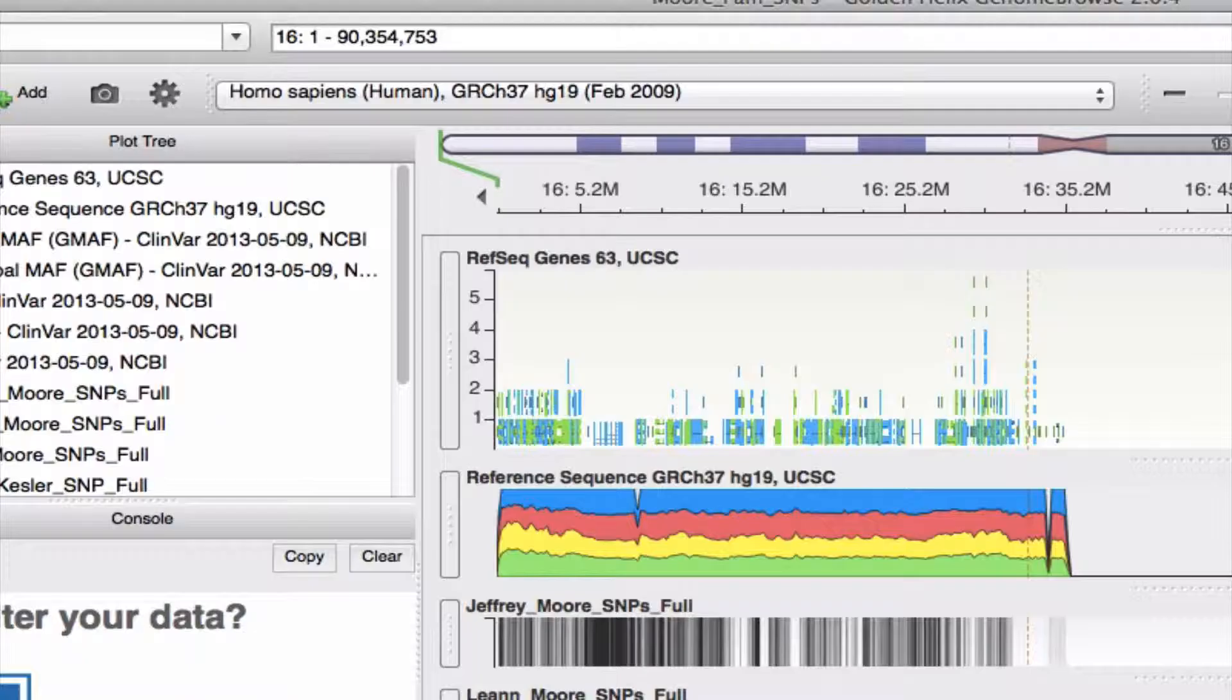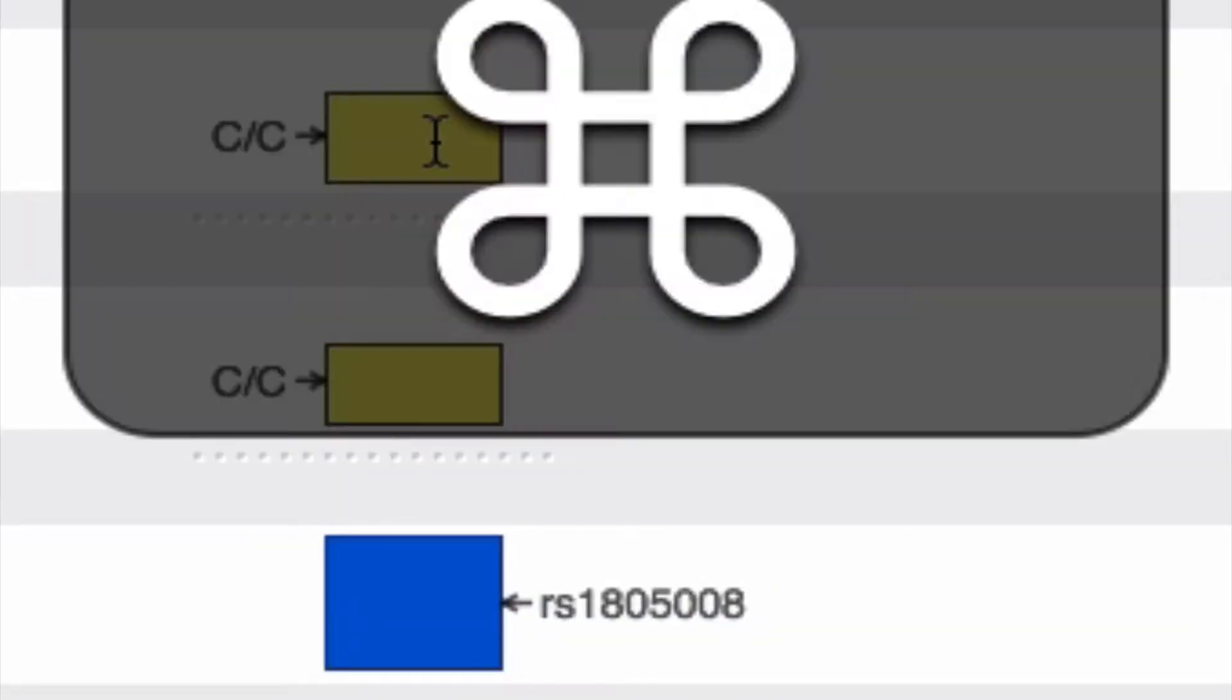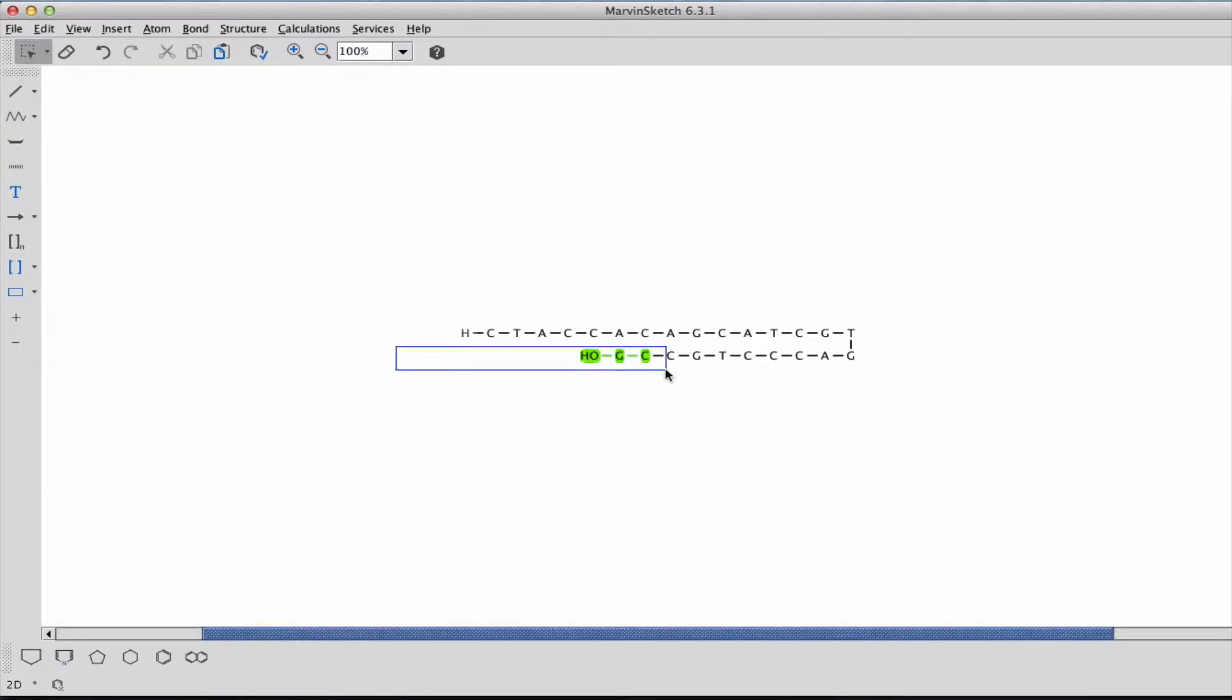So, for example, there it is in my genome browse. Let's go back and copy that sequence and paste it into Marvin's sketch. Get it all situated in a way that looks nice.